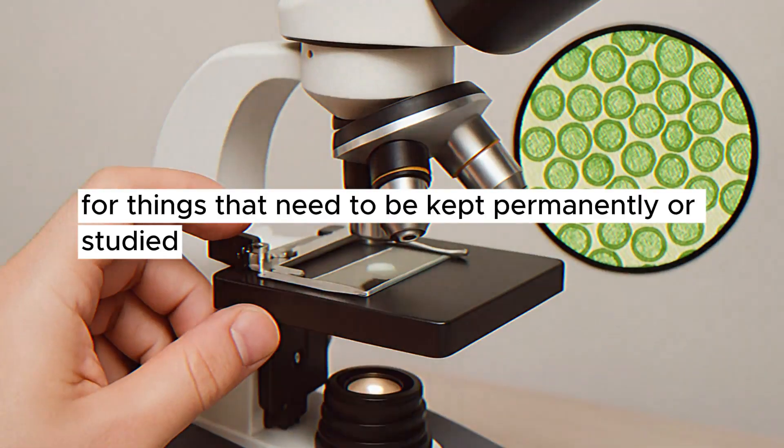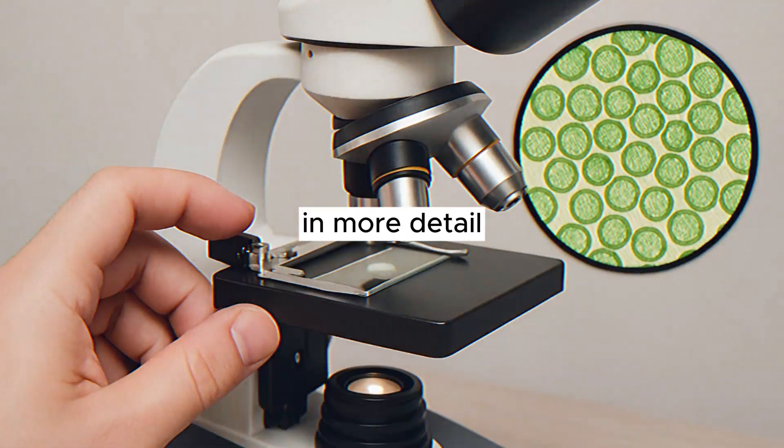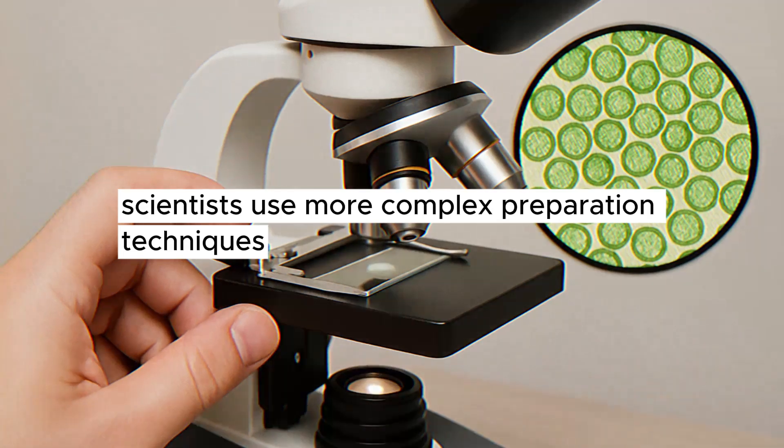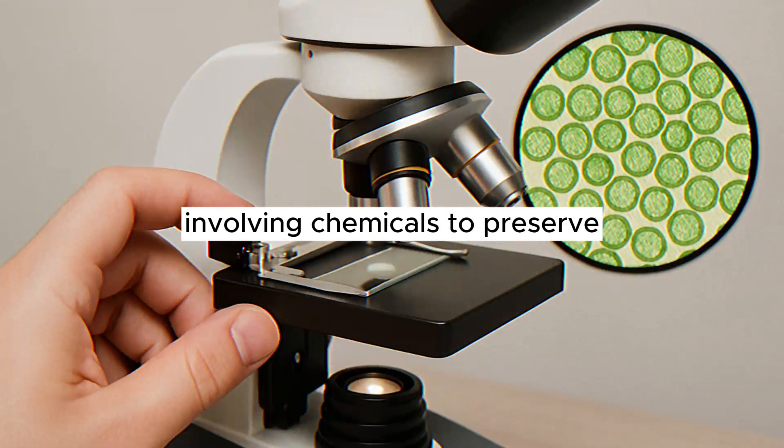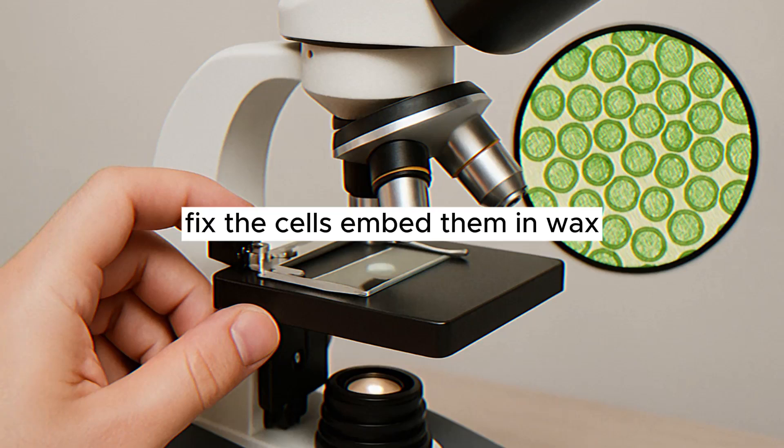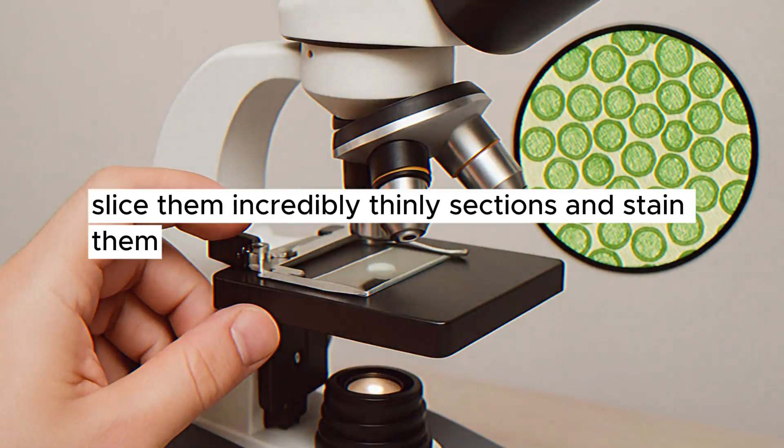For things that need to be kept permanently or studied in more detail, scientists use more complex preparation techniques involving chemicals to preserve, fix, the cells, embed them in wax, slice them incredibly thinly, sections, and stain them.